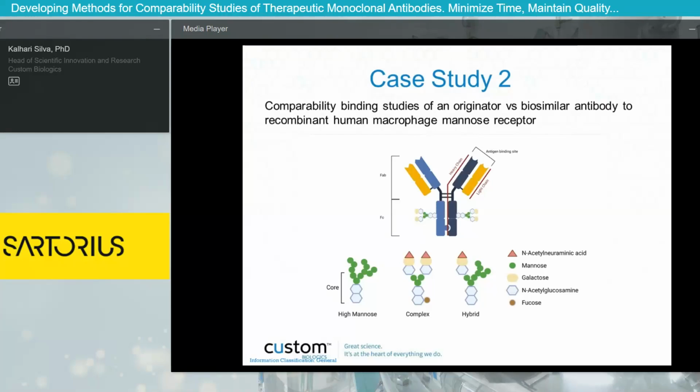As you know, monoclonal antibody drugs are complex and heterogeneous mixtures of various variants. Glycosylation of biopharmaceuticals shows a high degree of heterogeneity, and this N-glycosylation that happens is most complex and leads to diverse structures in nature due to the different sugar moieties that you see on the slide and possible linkages associated.